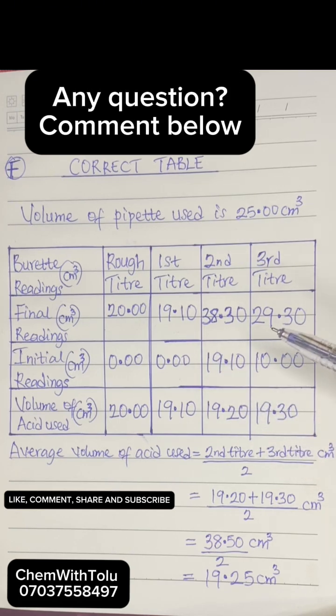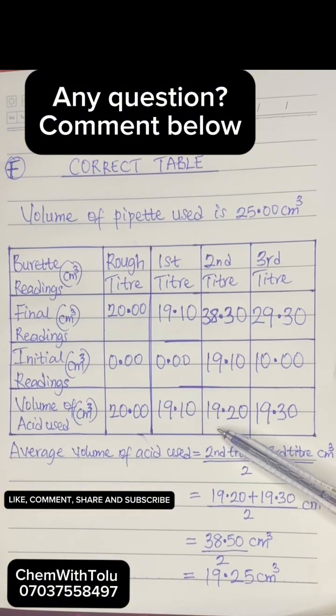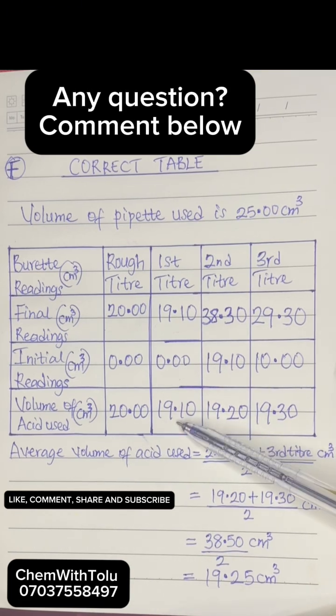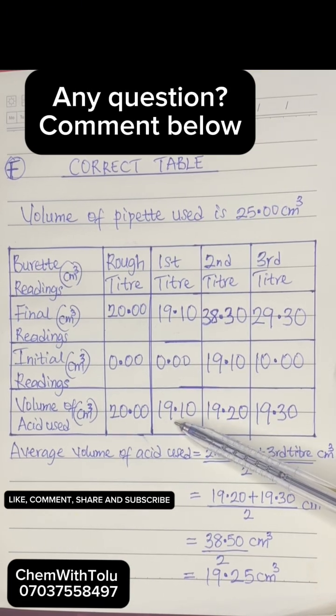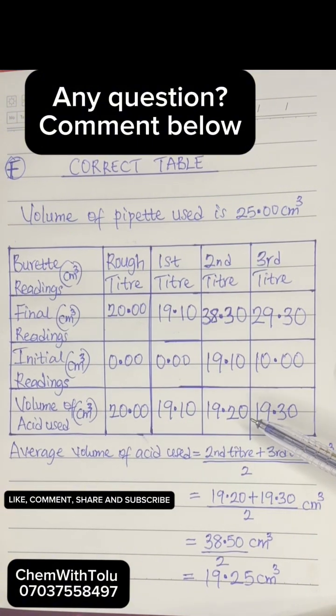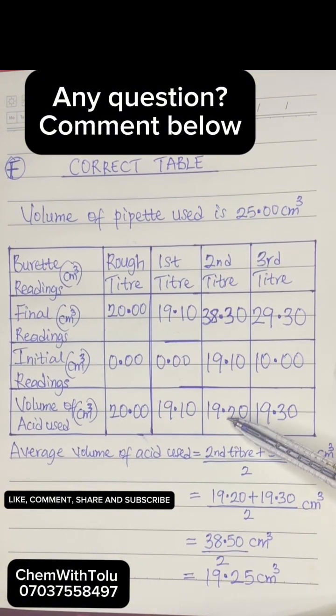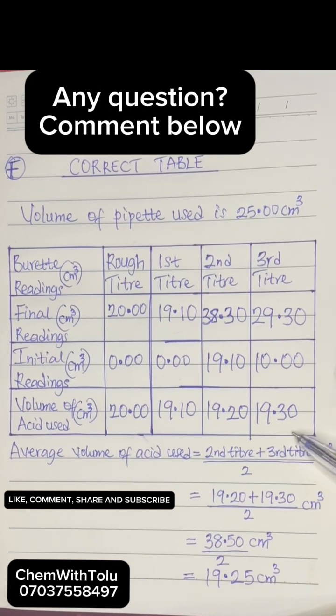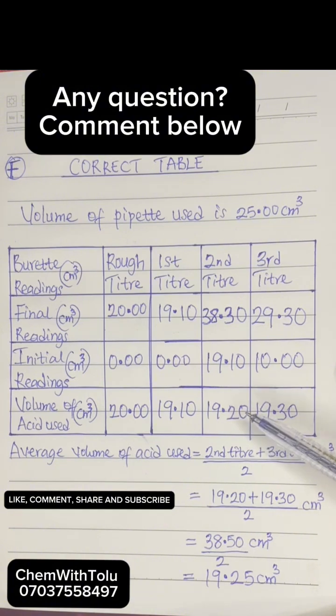So you can see. So the next thing is for me to look at my concordance. Now see 19.10 minus, you have 19.20. So 19.20 minus 19.10. So you have what? You'll be having 0.1. And then if you look at the next one, 19.30 minus 19.20, you'll be having 0.10. So when you have values like this, the first two values that are higher and they are concordance of 0.10.